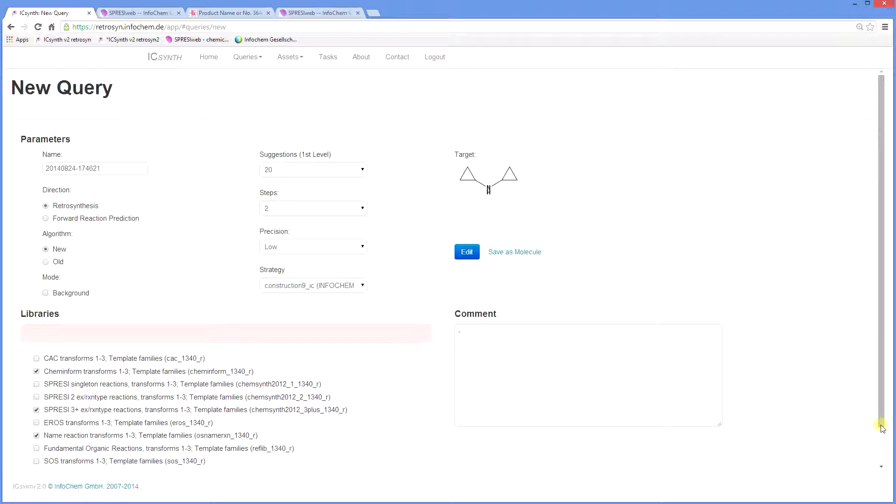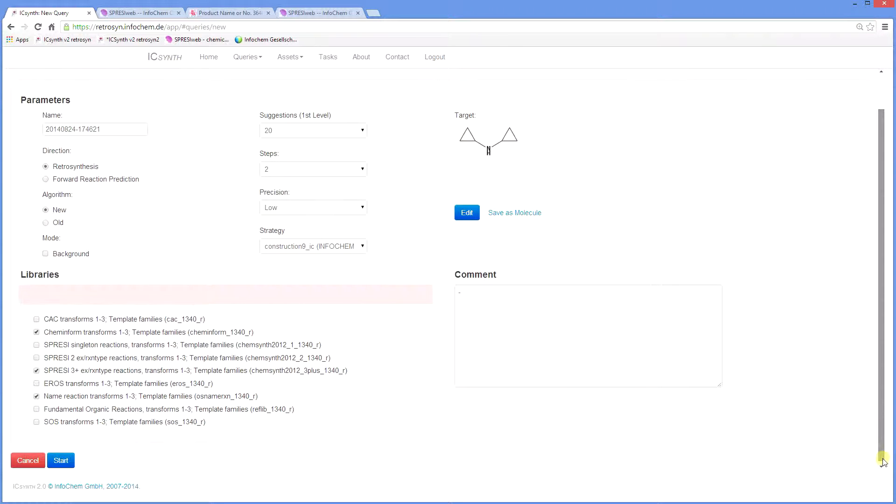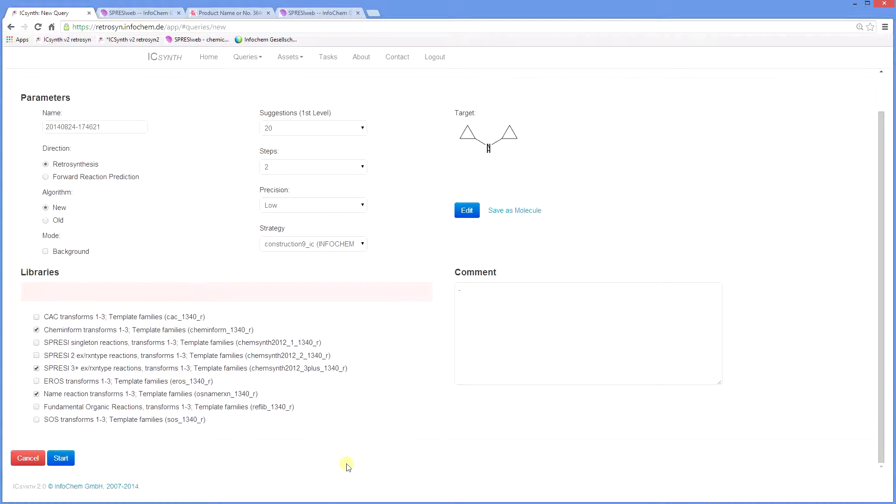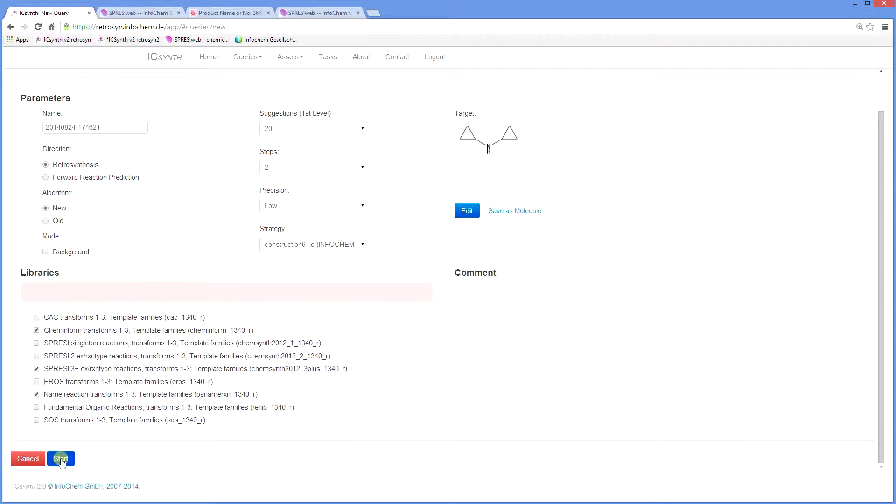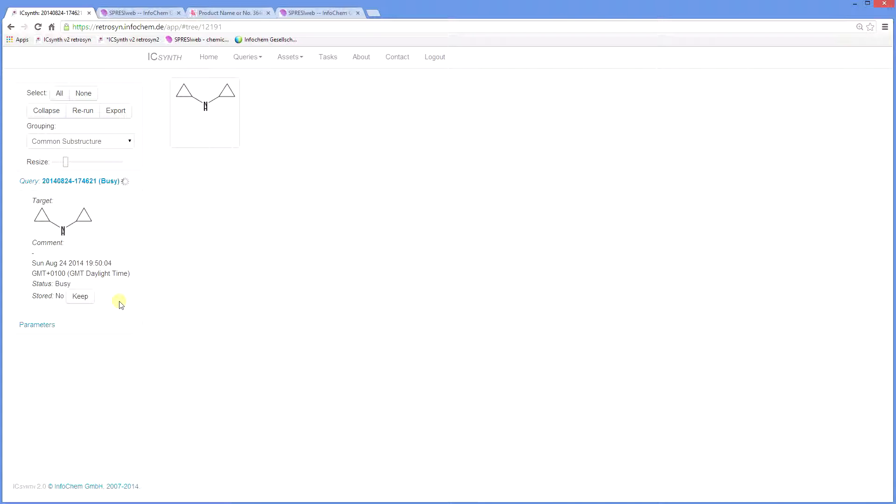Having completed our parameters, we can then press start to begin the query analysis. The system indicates that it's busy and will tell you when the result is ready and the tree is finished.